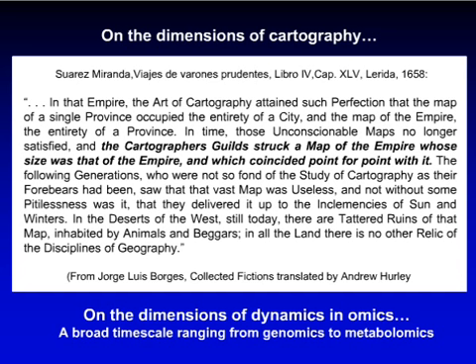But what we need to do is measure as much as we can and go from an untargeted analysis to a targeted analysis very quickly. What I'll show you at the very end are our efforts to do just that. One thing I would note is that our proclivity for generating data is really unsurpassed. We can generate about a terabyte of data in an hour, so what we do with that information in terms of bioinformatics and biostatistics is of tantamount importance.